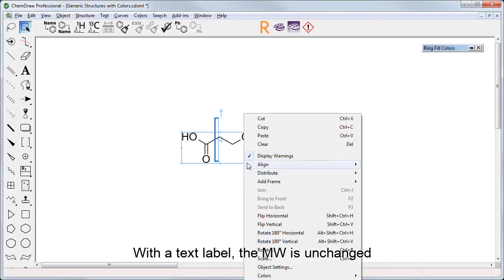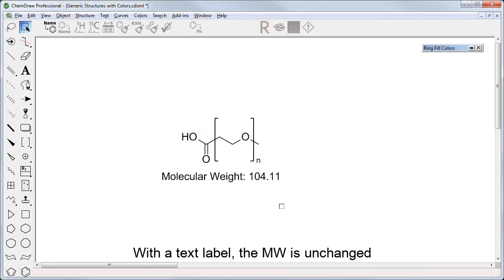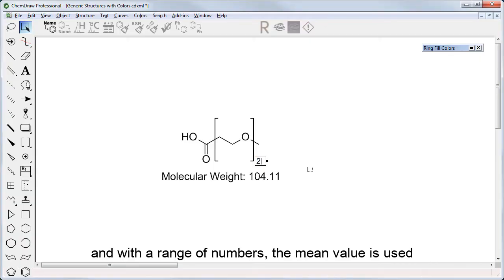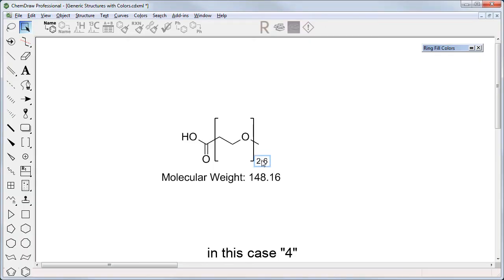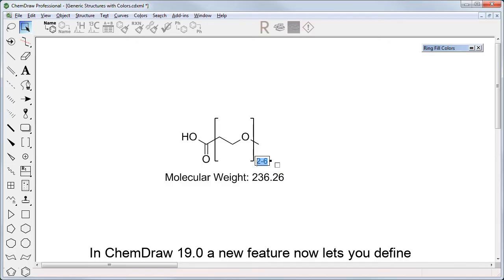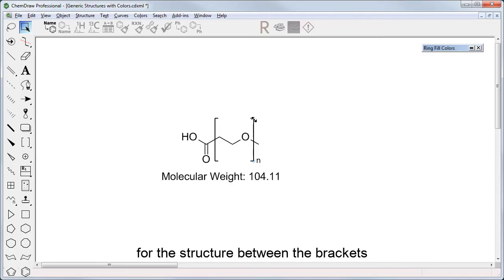With the text label, the molecular weight isn't changed, with the number it evolves, and with the range of numbers the mean value is used, in this case 4. In 19, a new feature now lets you define the average molecular weight for the structures between the brackets.